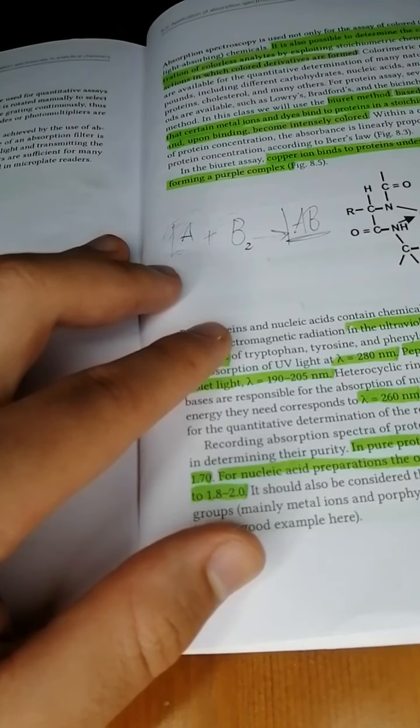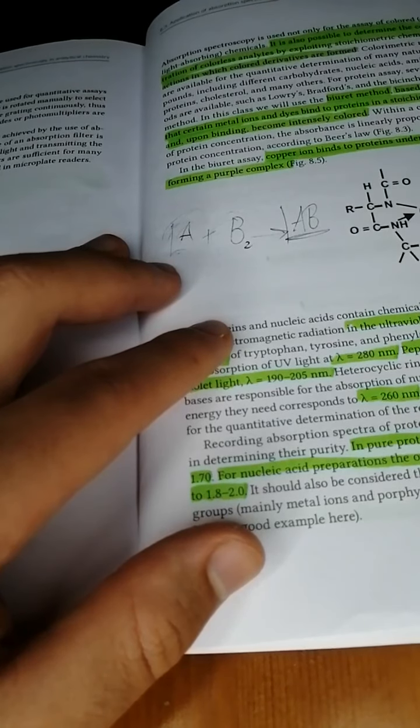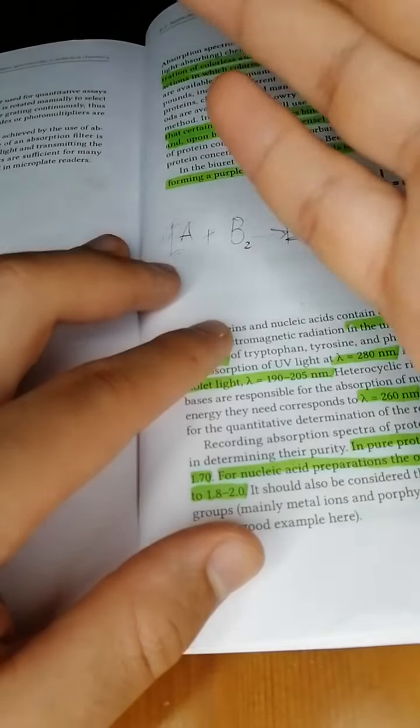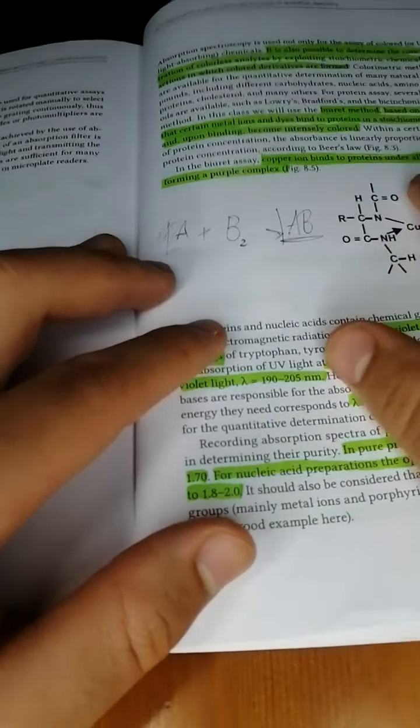So you don't know how much protein there is. What you do is react that protein with copper to form a colored product, and that colored product's concentration can be used to find the concentration of the original reactant, which would be the protein.